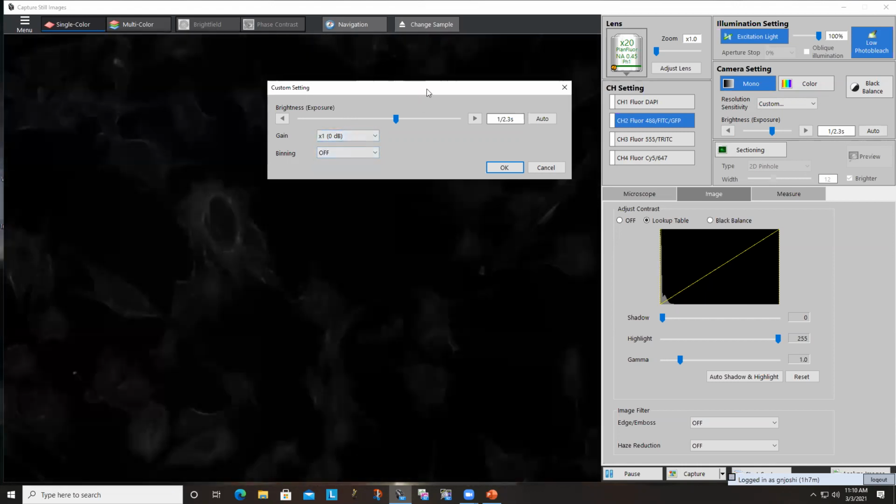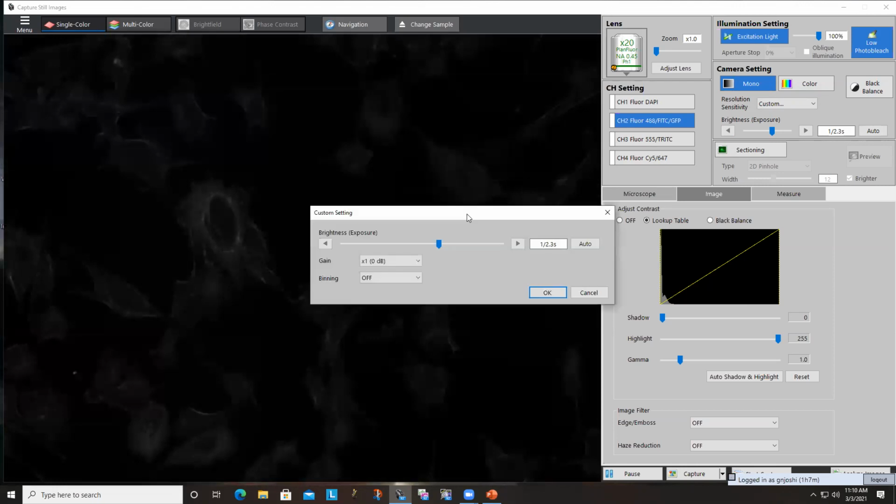So what I want you to focus on is when I was telling you that your intensities shift from left to right, right? So if it's from 0 to 500, it goes from 100 to 600. Have a look at this right over here. What you will see is, right now with a gain of 0, it is from 0 to let's say 50.